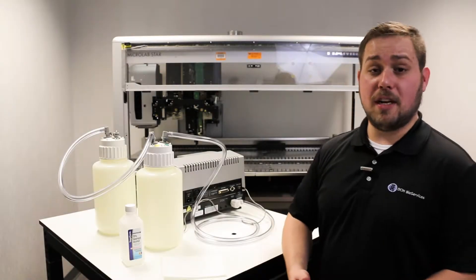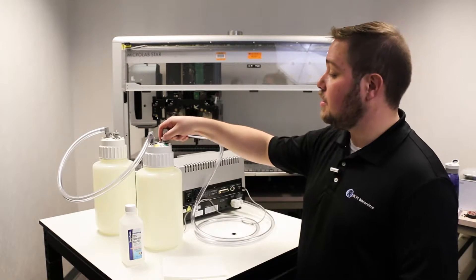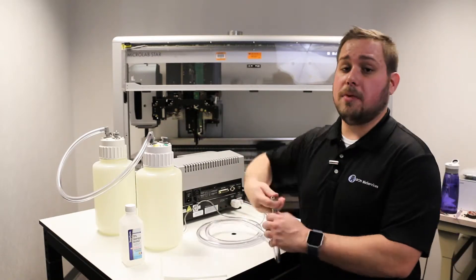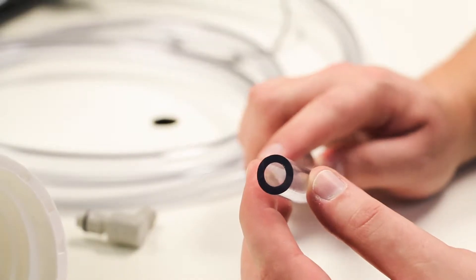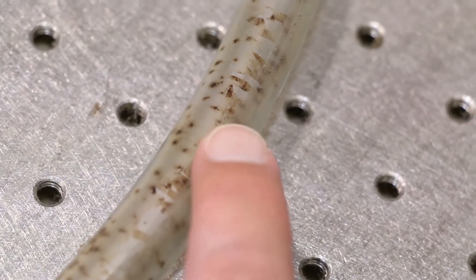The most important aspect of your Biotech's waste line system is the tubing itself. Use only vacuum-rated, thick-walled tubing for the waste line system. Make sure the tubing isn't kinked or have anything building up inside of it. If it does, you probably need to replace it so that you get a good vacuum pull.